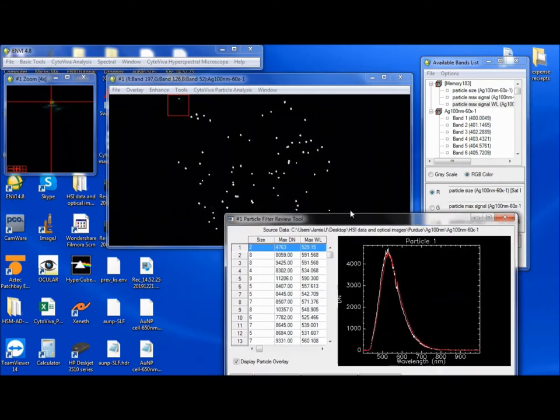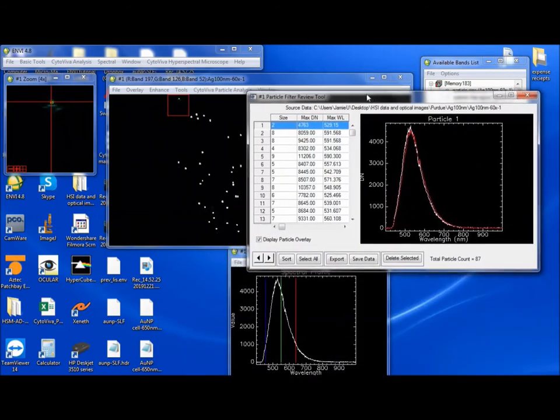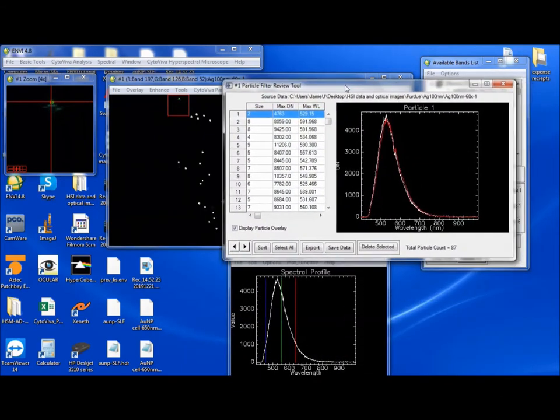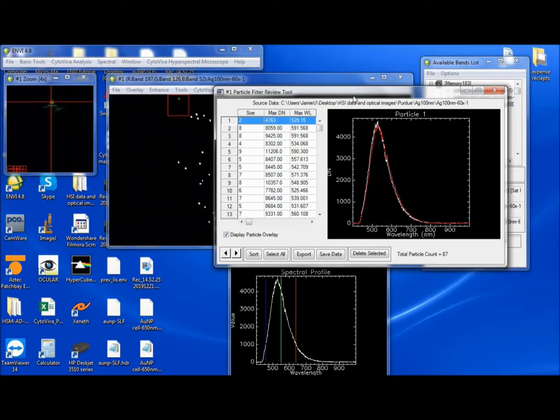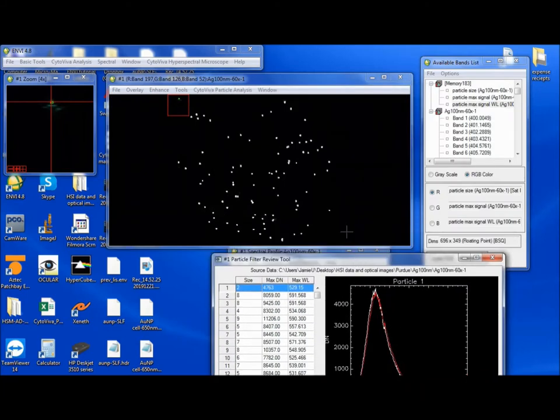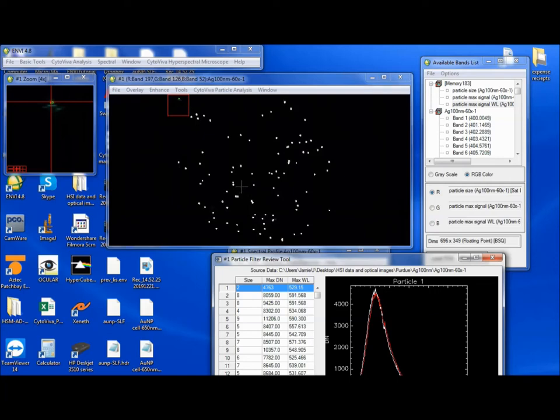So what we see here is this table that pops up. And this table shows, first of all, this particle count here, 87 particles. And if we look at the image, we see it highlighted all these particles in white. And it looks like it pretty much got everything. There's something dim here it didn't get and some background noise. This particle right here it didn't quite catch.